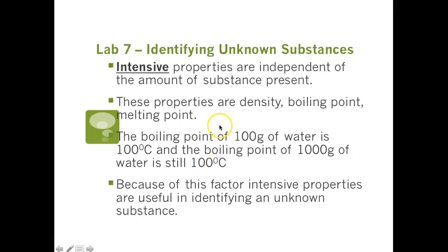So intensive properties are not dependent on the sample size. It's not dependent on the amount of stuff that you have. And therefore, those are factors that are key to identifying an unknown substance. And that's what we will be determining in this particular lab.